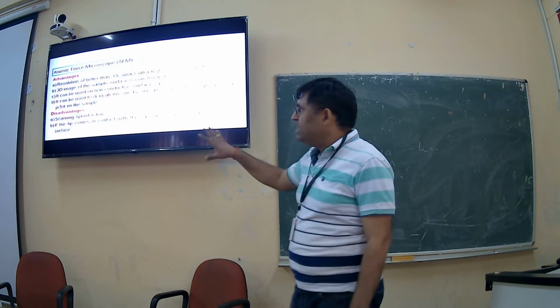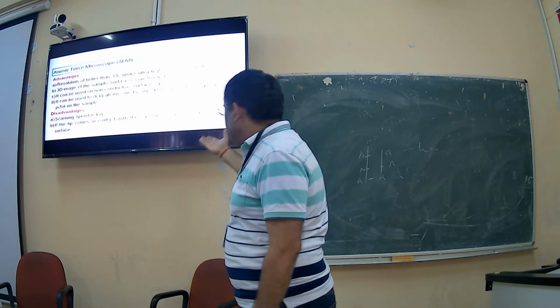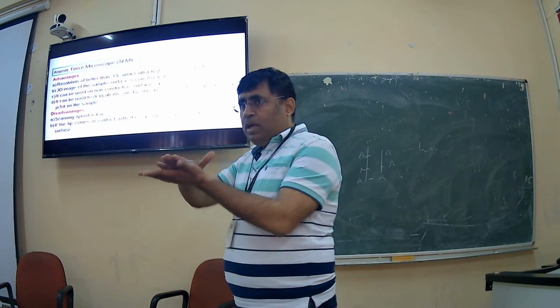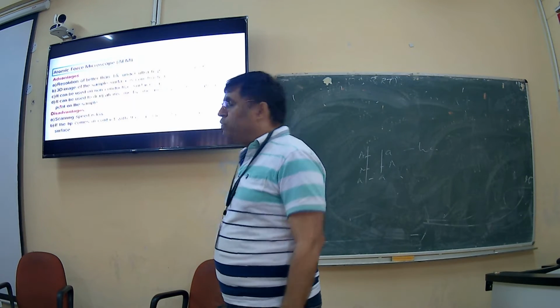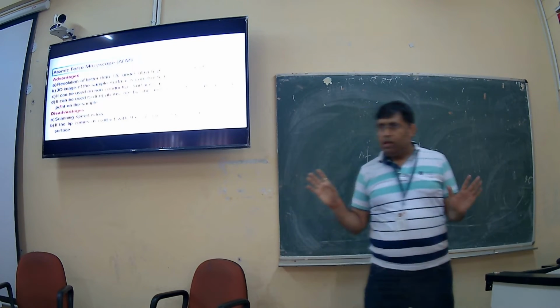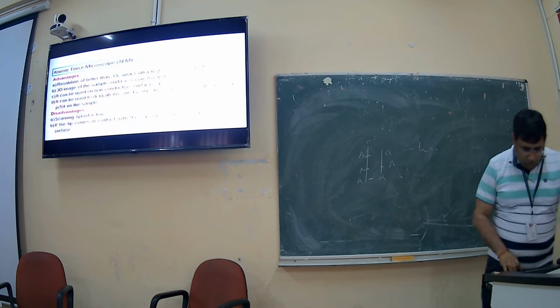Advantages and disadvantages: the scanning speed is low. If the tip comes across a hard surface, what can happen? It can distort, because your tip may be distorted. Okay. So this is the problem with the atomic force microscope. Is this okay? So this is the end of the second topic.